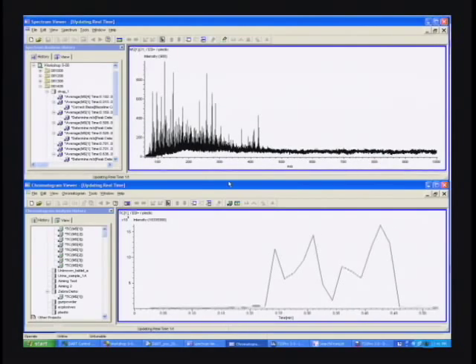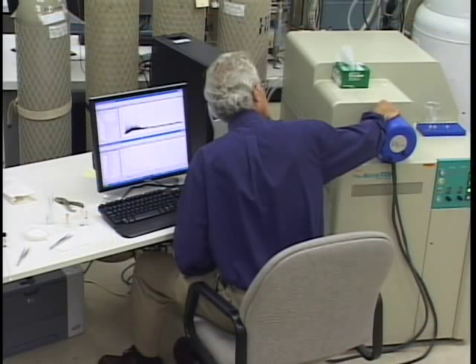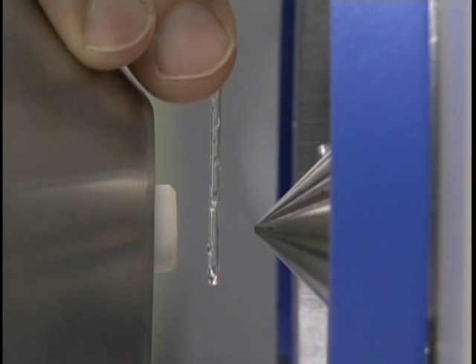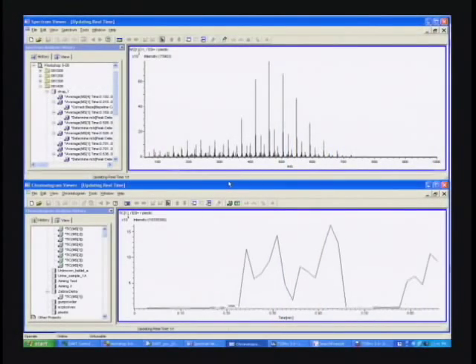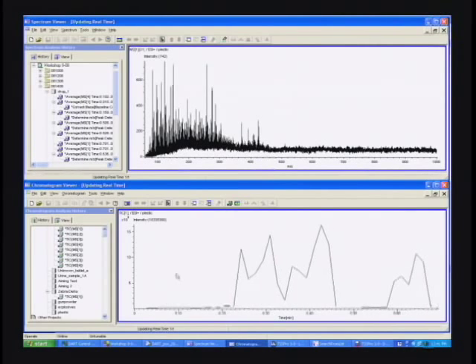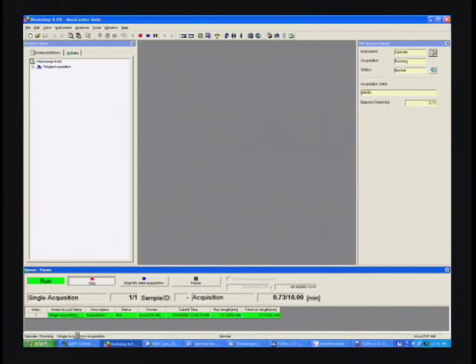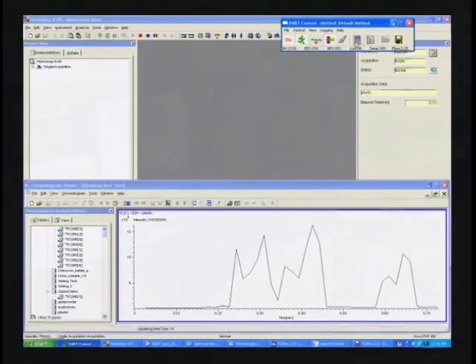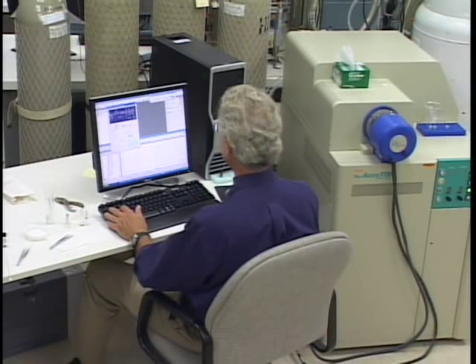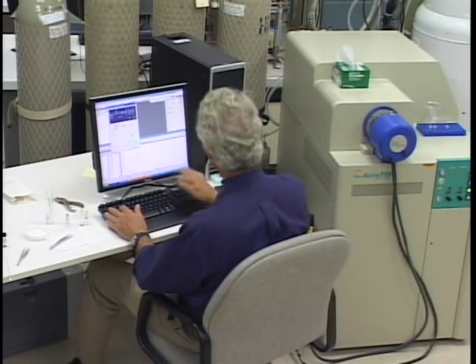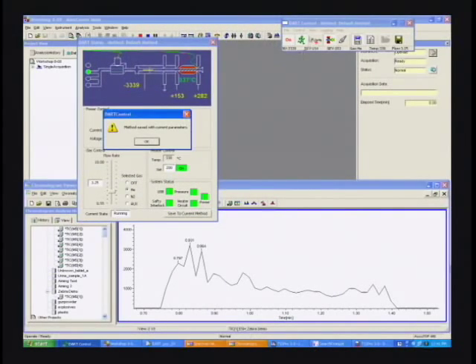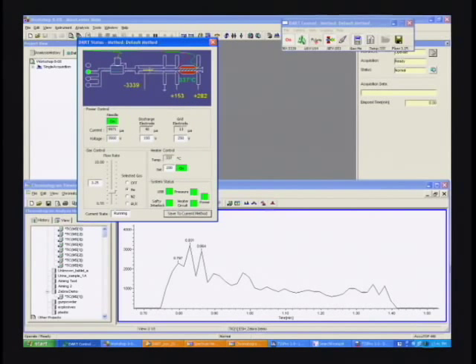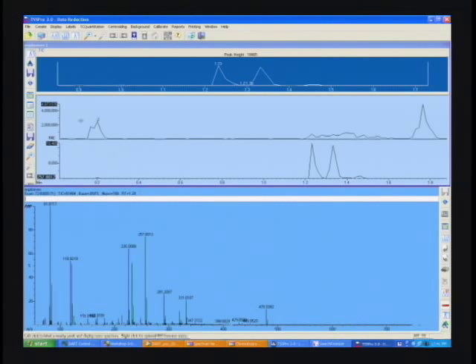And run the PEG spectrum just like we always do. The PEG spectrum in the data file, so there's never any question in the future about whether we had a calibration for this particular sample. We're done. Stop it. Put the dart back on standby. We're not going to run anything this hot again for a while, so let's just turn the temperature back down and let it cool down. Put it back on standby and then open the data file and see what happened.